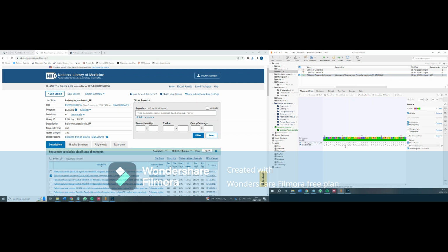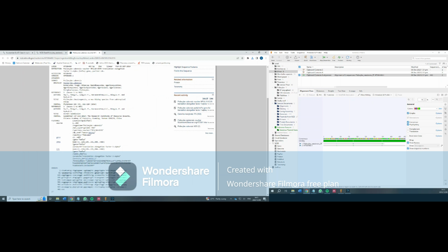That's all good. So now when you annotate the sequence you downloaded for GenBank, it'll be the same for your sequence also. So you can see the mRNA, those are the intervals, and you can see it's the same for mRNA and CDS. It's always going to be the same intervals. Just go ahead and annotate them. I just copy and paste. Highlight the region that's necessary for the mRNA. You can see it's 1 to 138.